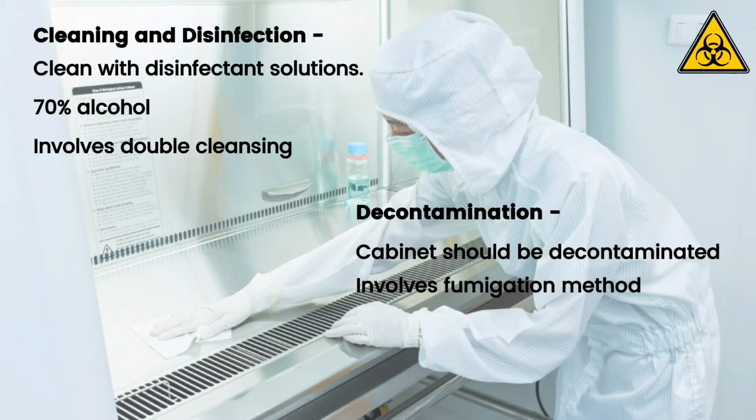What is decontamination? Before moving the cabinet or before changing the filter, the cabinet should be decontaminated. The cabinet is decontaminated by fumigation method using formaldehyde gas. Decontamination of the equipment should be followed by a qualified professional.